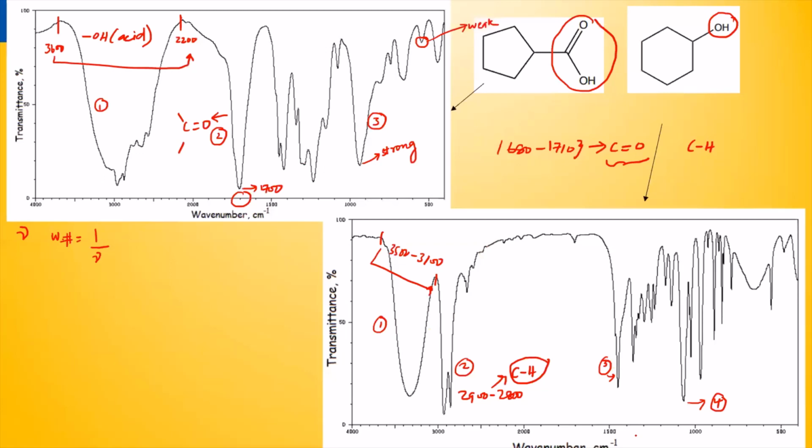You can actually go look this up, and it could be that CH2 bend, which is around 1480, something like that. This is a CH2, remember? So again, those are very supplementary. The peaks always on the left hand side of the screen, those are the giveaways, right? So we know which one is which.